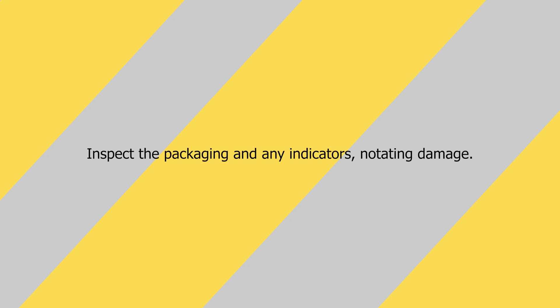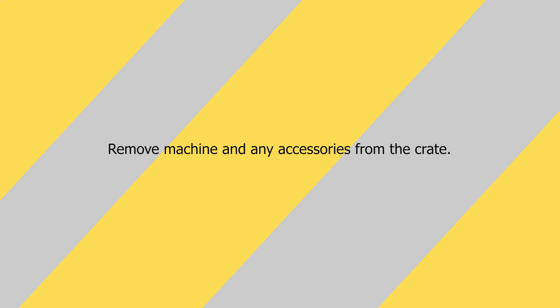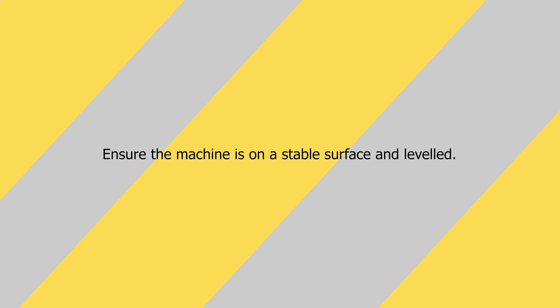While this video may not have depicted your specific model, the principles are similar. Step 1: Inspect the packaging and any indicators, notating damage. Step 2: Carefully remove hardware and save the crate for future use. Step 3: Remove the machine and accessories from the crate. Step 4: Ensure that the machine is on a stable surface and leveled.